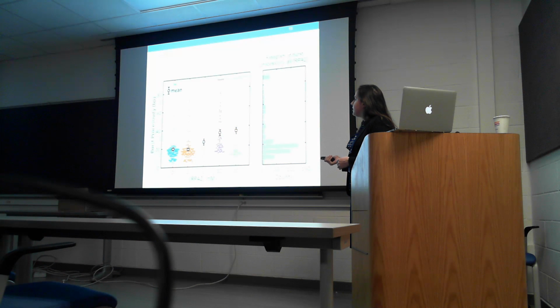You can see the average, these white dots, is increasing with RPA concentration. You can also see the distribution: there's a large population of low processivity unwinding with a long tail of higher processivity that is present even without RPA. As we increase the concentration, we see more and more bursts fall into this tail.